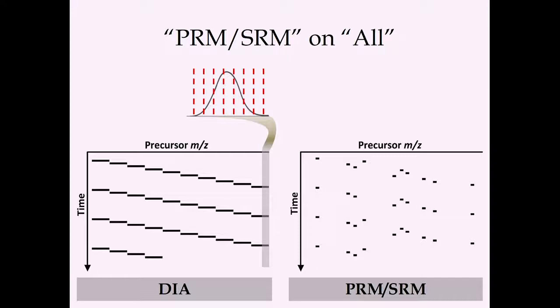But this does require people to be good chromatographers. Good chromatographic peak shape is a really key component of this. And this is something that people will often get good DDA results with good spectrum counts, and then they're not quite clear why they're struggling with their SRM or targeted methods. And it's largely because data-independent acquisition is a targeted method, at least from my perspective.